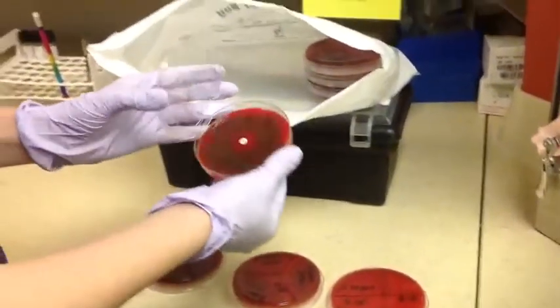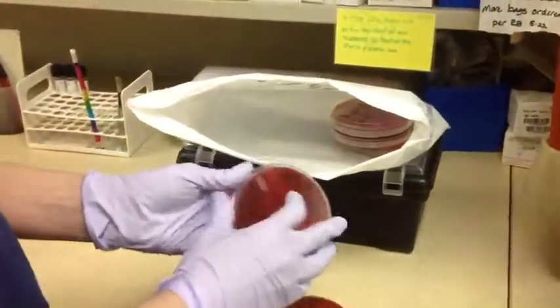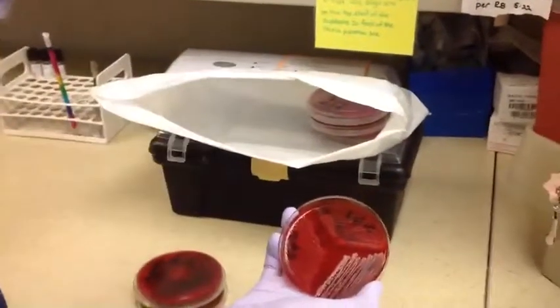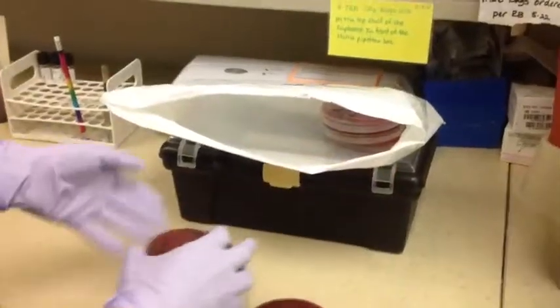This is strep pneumo. It most commonly causes pneumonia. Other ones. We've got strep A, which causes pharyngitis. We've got strep B down here in the corner, and then just another staph. So, that is the lab in a nutshell.